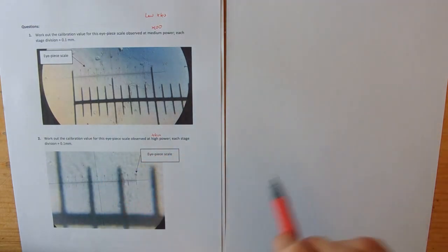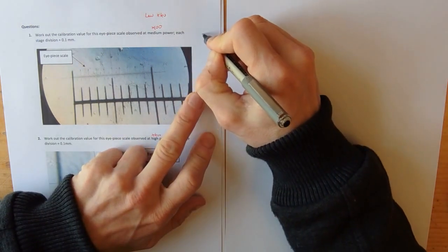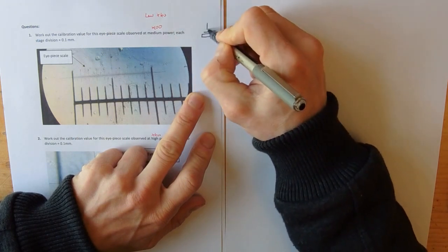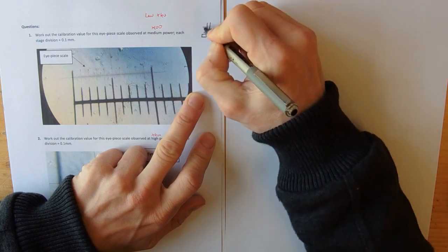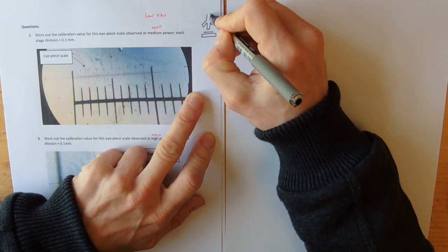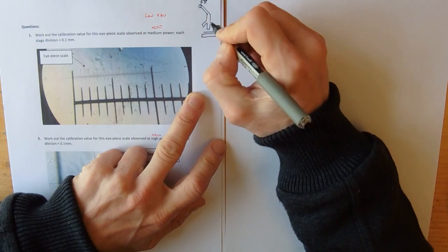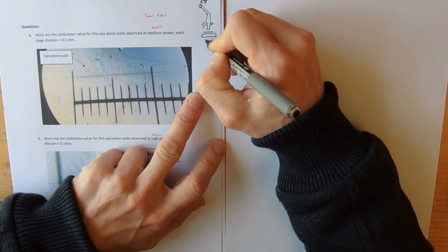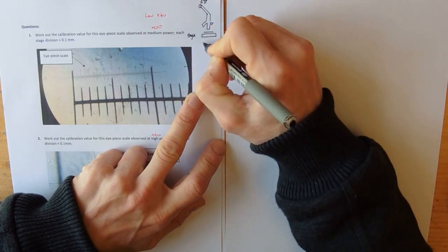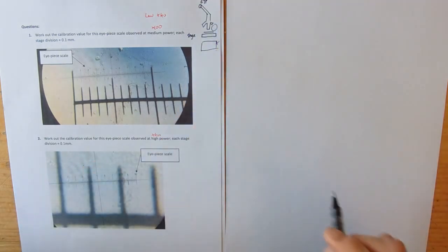And the calibration value, well, let's remind ourselves of a microscope. So a microscope is a stage with a slide on with an objective lens coming down, and there's various lenses, low power, high power, medium power and so on. Then that goes to the eyepiece. So the eyepiece is up there, and this here is our stage. And then we've got a light source and a plug and so on, various knobs and twiddlers.